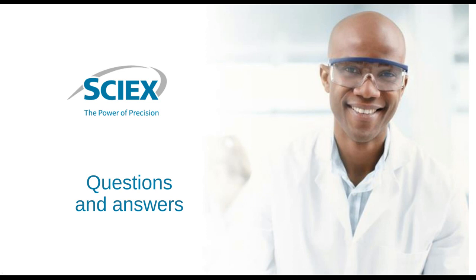And I guess in general, I would say the LIF affords you at least 10 times greater sensitivity, but I think that can be a little tricky here because these dyes are so powerful compared to some of the other ones on the market that it's probably even beyond 10 times, but I don't have an exact number off the top of my head. We can use a lot of the same tricks to increase the sensitivity, like how we're injecting the sample, but the enhanced sensitivity of the LIF really pushes it down to that sub-nanogram per mL level.